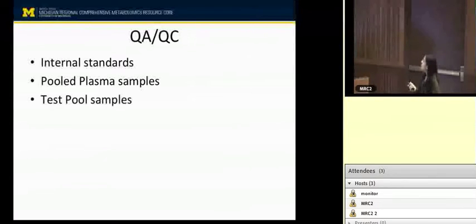This is another example, PE 34:0, which is also our internal standard, and the characteristic neutral loss here is a 141 neutral loss, which is this 579 peak. So the quantification, after the identification based on the MSMS data, is done on MS1 data. This is again, TM showed a similar plot where we show how each of these classes elute. Lysos elute early in the retention time, DGs, PCs, and PEs come somewhere in the middle, and TGs and cholesterol esters come towards the end of the chromatogram.